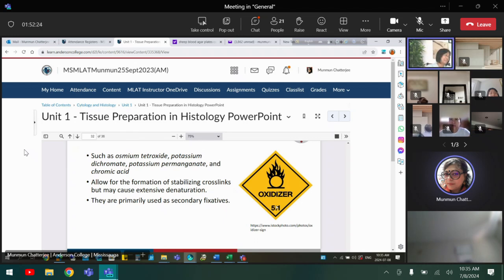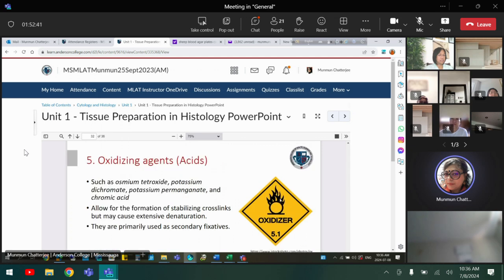Oxidizing. Why is it oxidizing? What can it cause? It will be flammable once it's close to a heat source, when there is a source of oxygen, any kind of ignition. And then it can cause fire. That's why the O represents the oxygen and the fire.